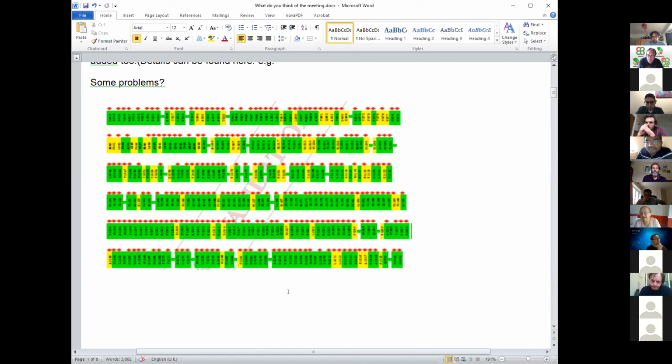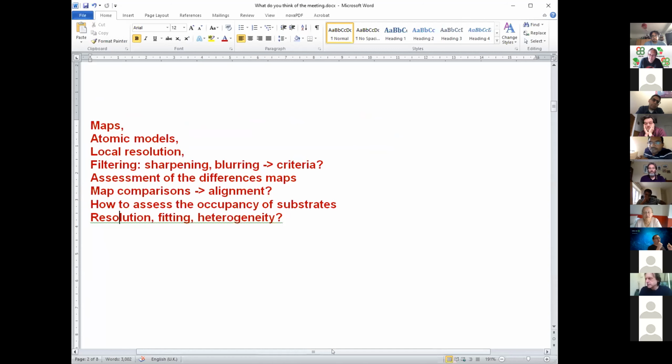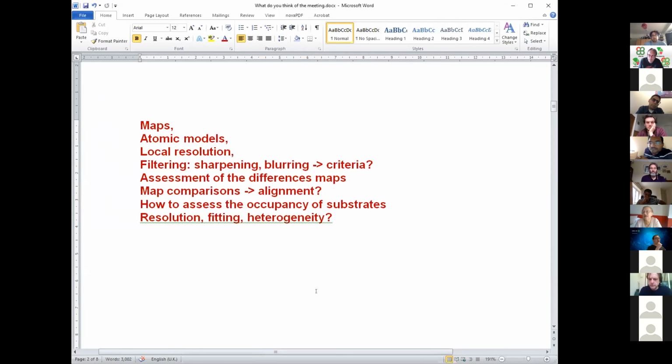But everything is perfect in terms of geometry. If, for example, believe me, every 10th amino acid is out, I would not mind. Then it's lousy fitting, etc. But when all of them are out, oops, that is systematic. Yeah. If it's systematic, you should be able to correct that. Yeah. Sorry, point here, I'm partially responsible for producing that plot because that data was generated by my validation analysis pipeline. So I can briefly comment on that.